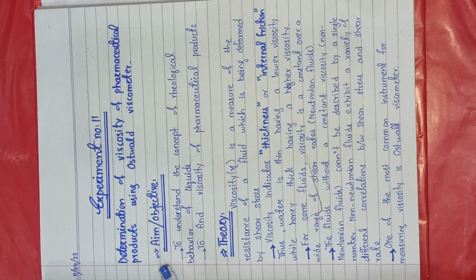Today's lecture is about practical of pharmaceutics, and this practical is about determination of viscosity of pharmaceutical products using Ostwald Viscometer. In the previous lecture, we have discussed the practical about determination of solubility of benzoic acid at different temperatures. But in today's video, we are going to determine the viscosity, and we use a specific instrument for the measurement of viscosity, which is Ostwald Viscometer.